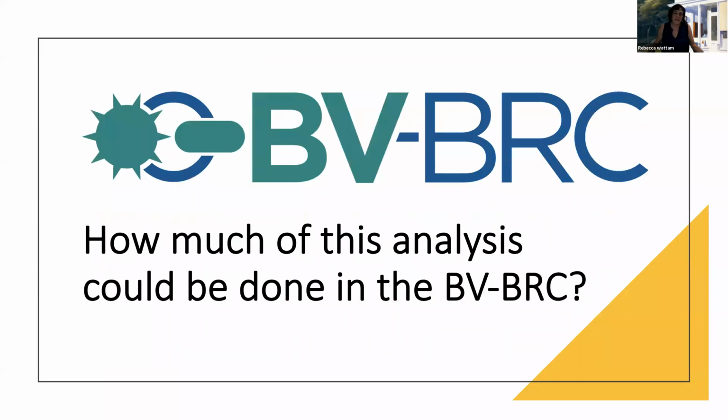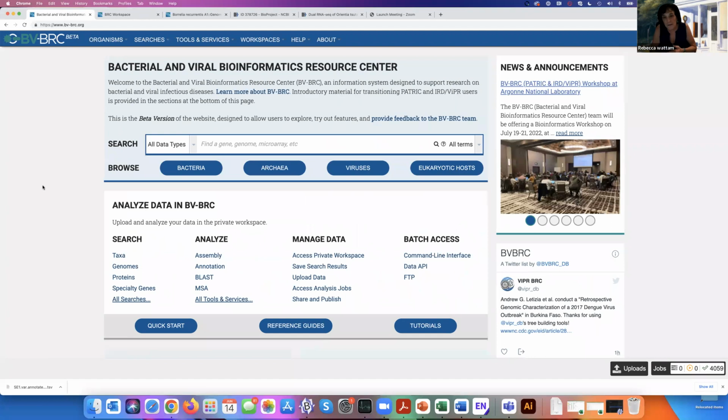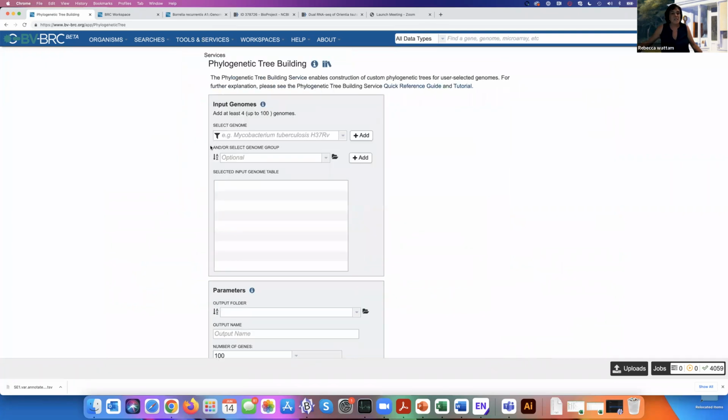So how much of this analysis can be done in the BV-BRC? So I'm going to leave the slides for a minute, and I don't want to leave you in the dark, but let's go over to BV-BRC. Now, we have 2 intense examples to do today, SNP analysis and RNA-Seq. If you've watched the webinars before, you know that we can do assembly in BV-BRC. We can build trees. I've stepped you through it.